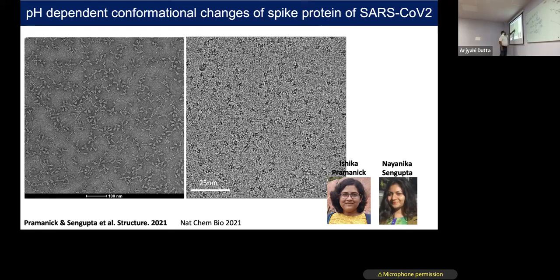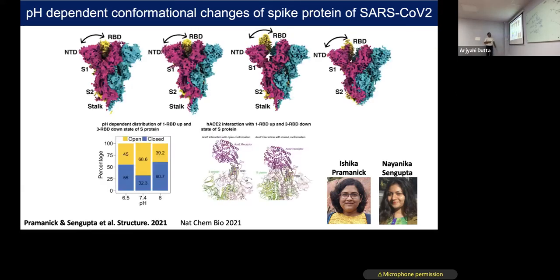That is why the background is comparatively white and your proteins are appearing as black, because scattering will be more due to protein. And here it is just the opposite, because of the heavy metal staining solution. That is the reason I put both images side by side, so I can explain that.